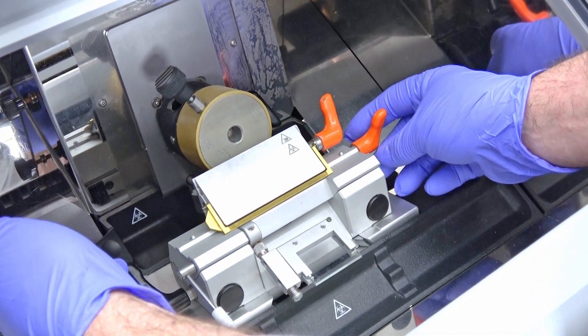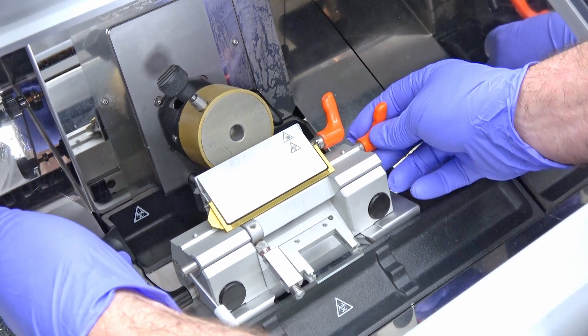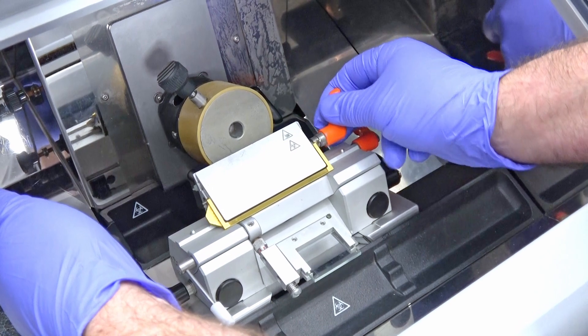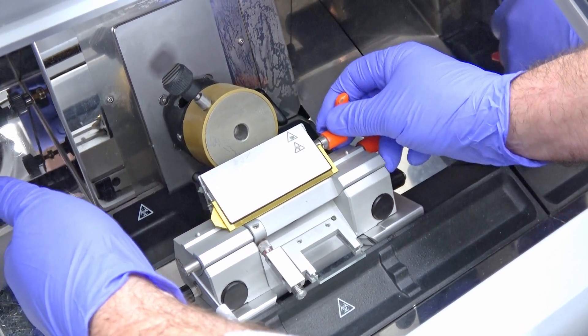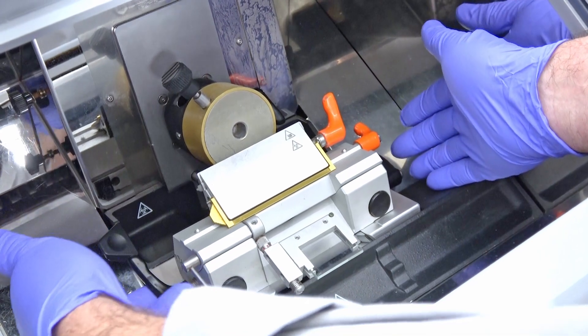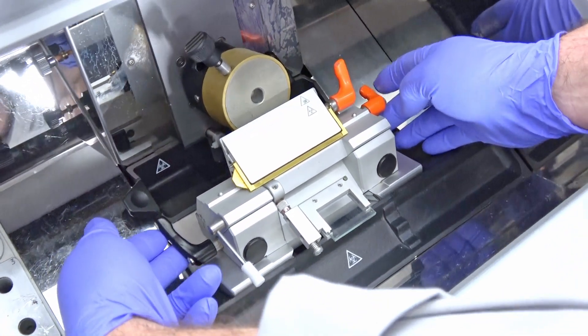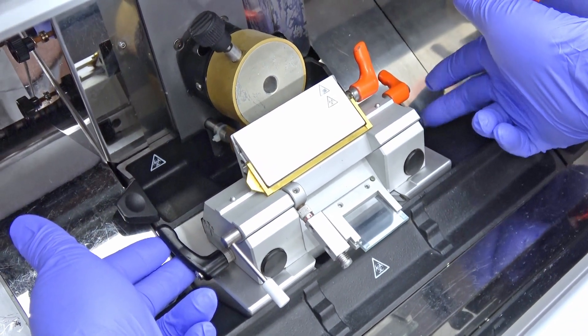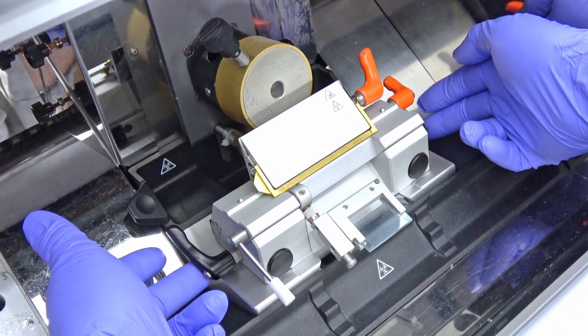When you tighten these you can also pull these out and then get the handles down so they're not sticking up and being annoying. Then you've got the knob on this side here. This is probably one of the most important knobs besides the other black handle.